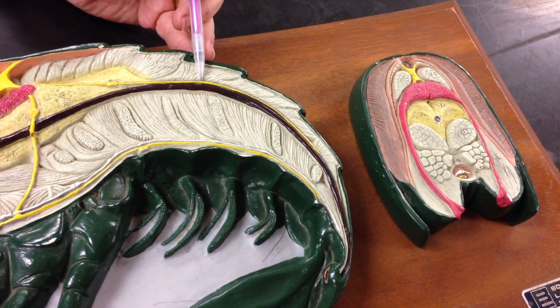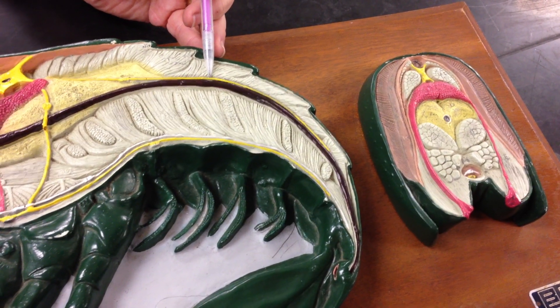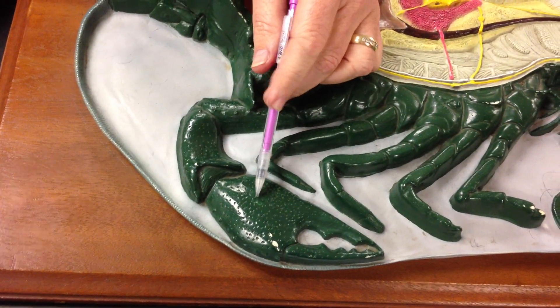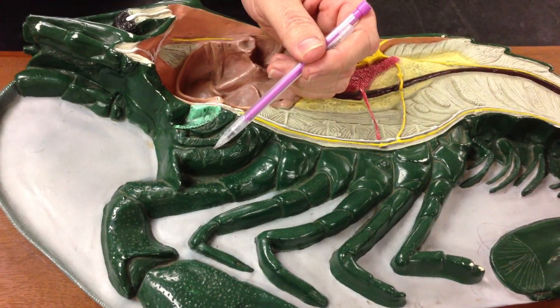Coming back over to the heart, I forgot one thing — we have the dorsal abdominal artery right here. And that concludes the tour. There's the chela and maxilliped. Thank you.